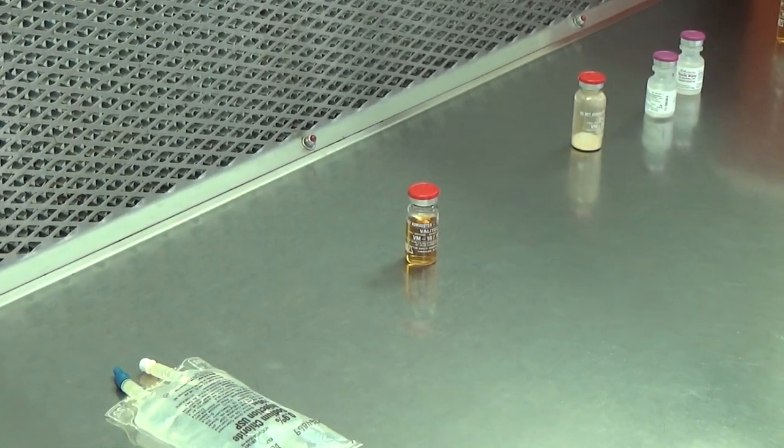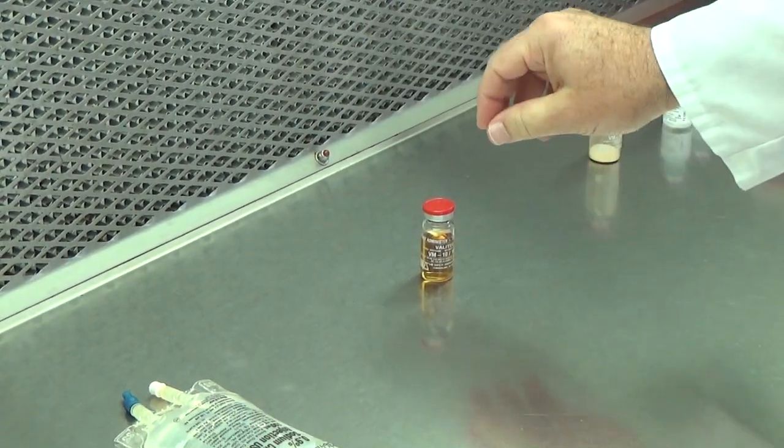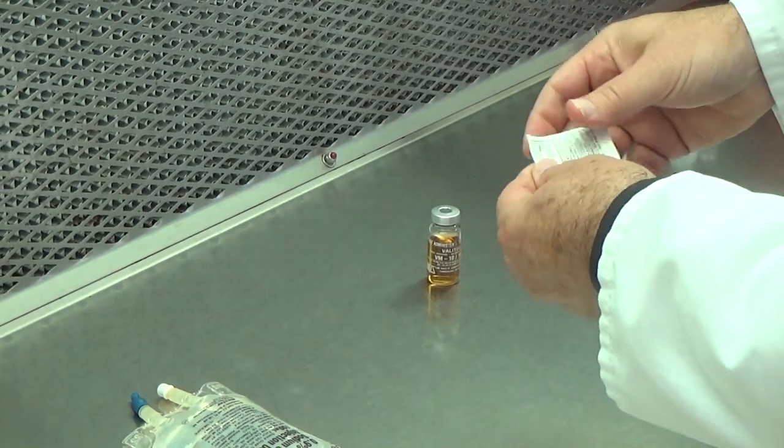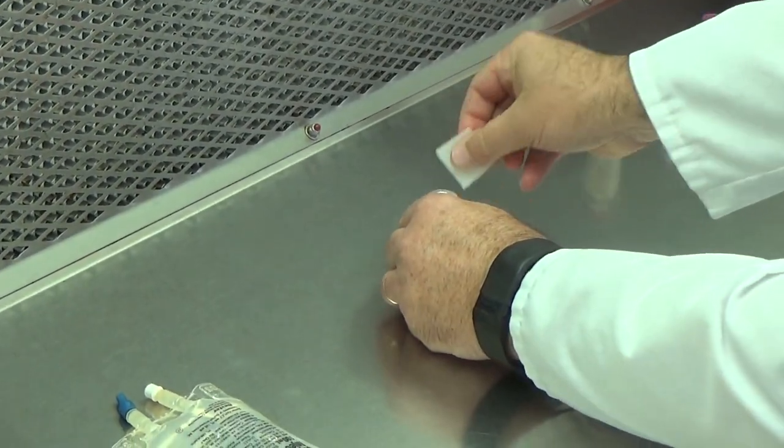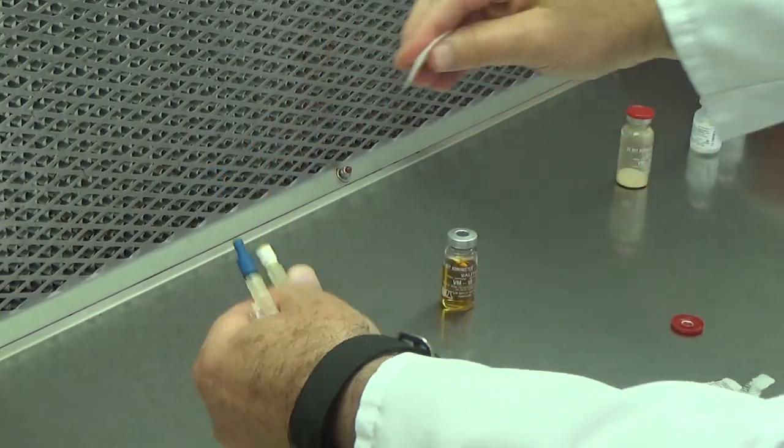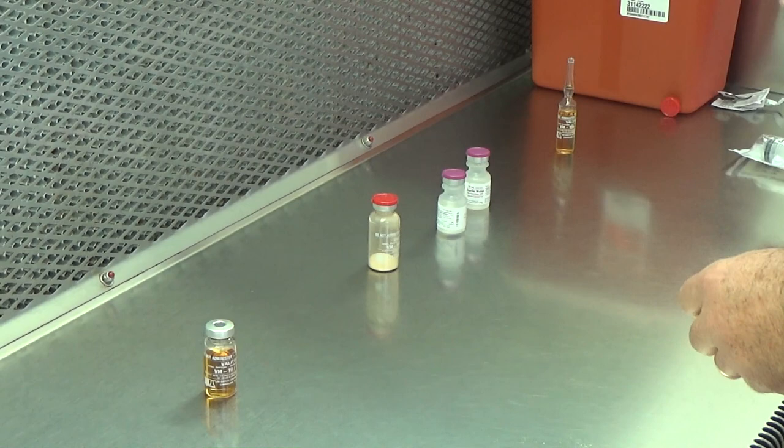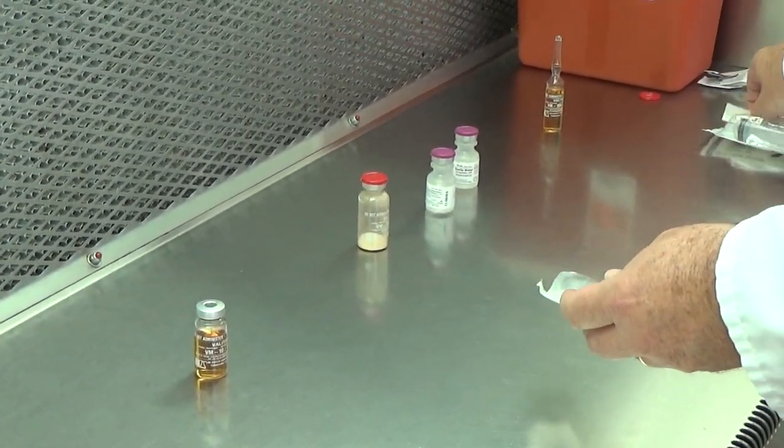The first thing I'm going to do is a simple transfer of 5 milliliters from a vial into the bag. The first thing you do is remove the tops and sanitize all your critical sites. While it's drying, assemble your needle and syringe.